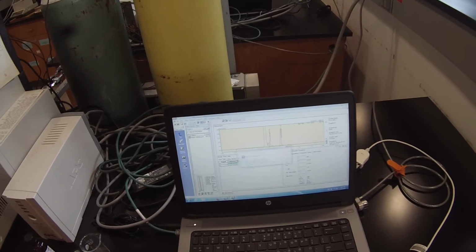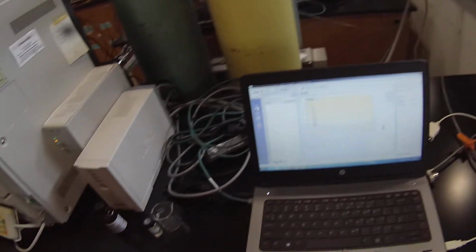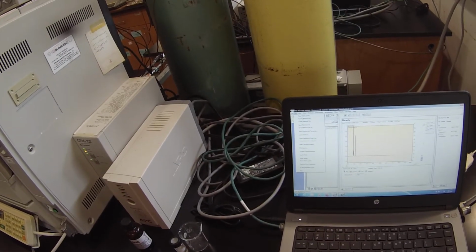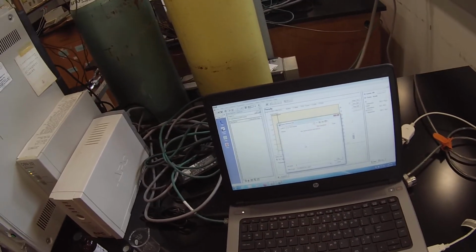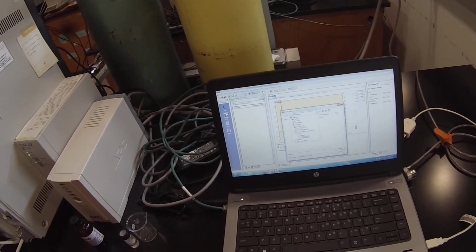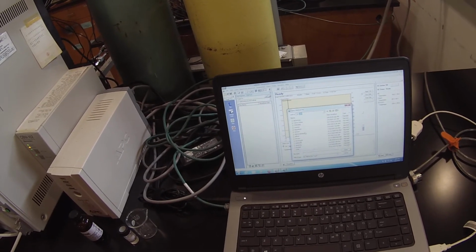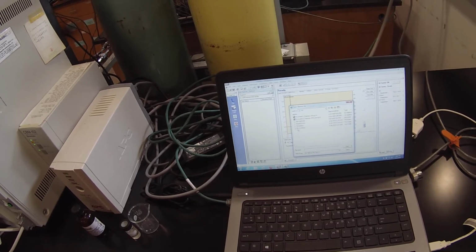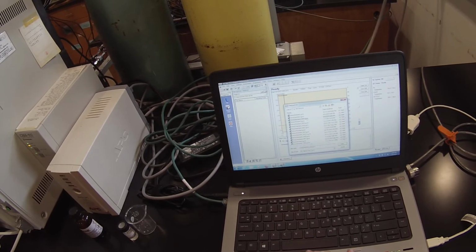So I know it's this year's method. And I'm going to close the data file, save it, sure, why not. And now I'm going to go and open that method. I'm not going to save the current one, that's not necessary. And that is under the data GC methods. Should be n-butyl halides 2 2020.